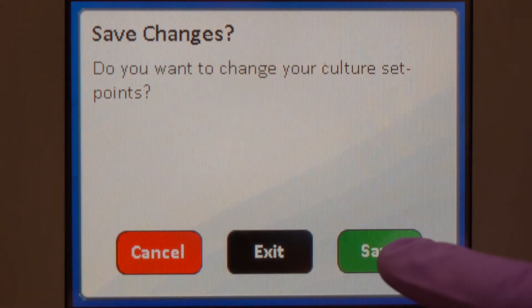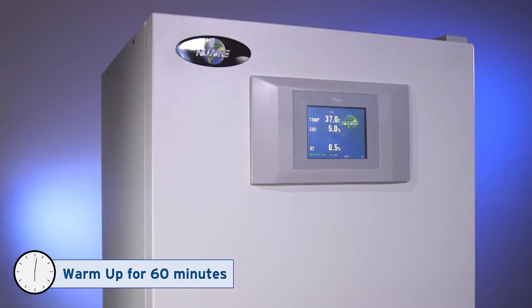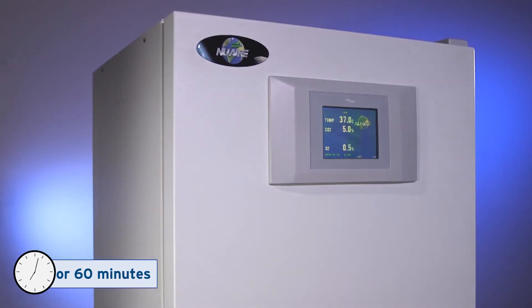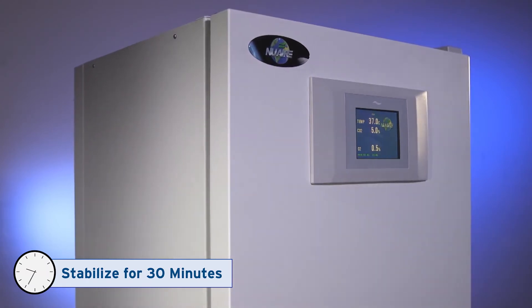Remember to save when you're done. Allow the system to warm up for 60 minutes. After reaching setpoint, wait an additional 30 minutes for the humidity to stabilize.